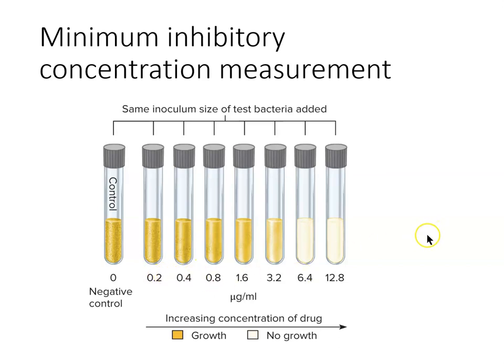And what you end up seeing is you can still cover a few orders of magnitude this way. Roughly every 3 dilutions is roughly a factor of 10. So if you have 6 dilutions, that's roughly a factor of 100.